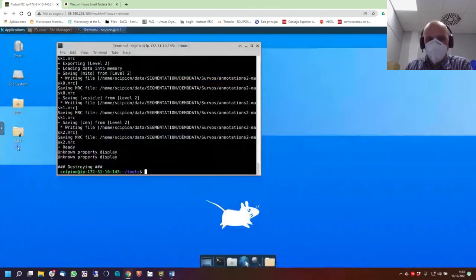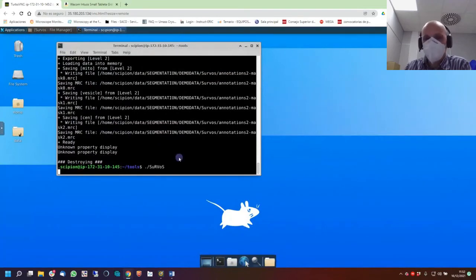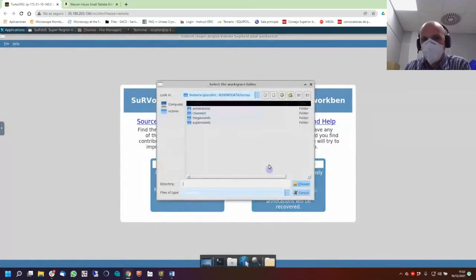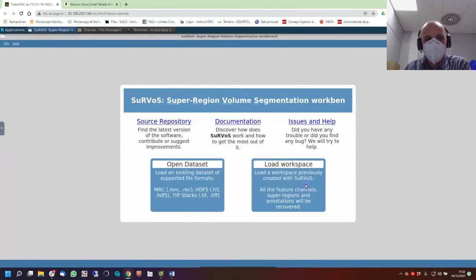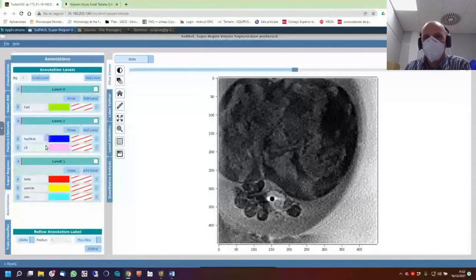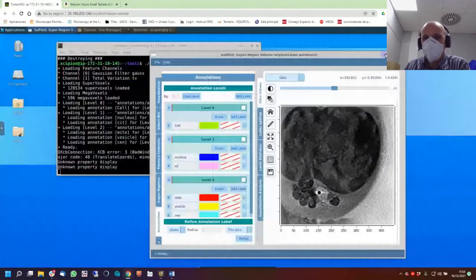Let me show you just one thing. If you click another day and you didn't finish, as I told you, just click here, select the folder with all the subfolders that were already created, and then choose. Then you will have everything here. That's something that you need to know, because sometimes you don't have time to segment every day, or the software gets stuck and you need to reboot it. So everything is saved and everything will be used.